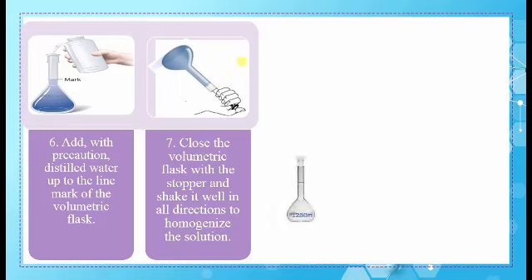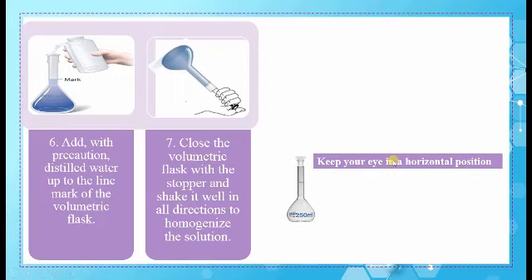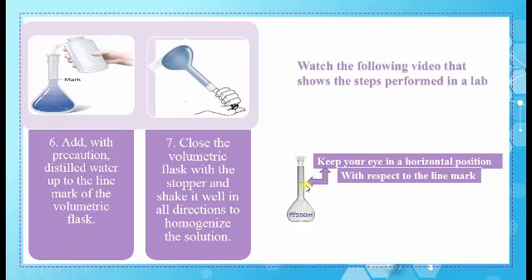And you have to pay attention when we add the distilled water up to the line mark. You have to keep your eye in a horizontal position with respect to the line mark. Watch the following video that shows the steps performed in a lab.